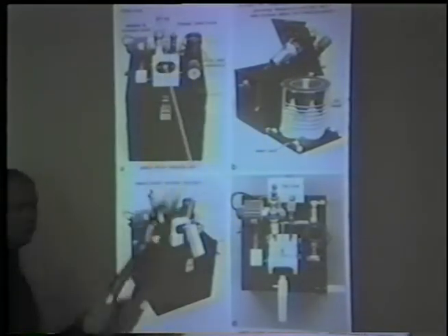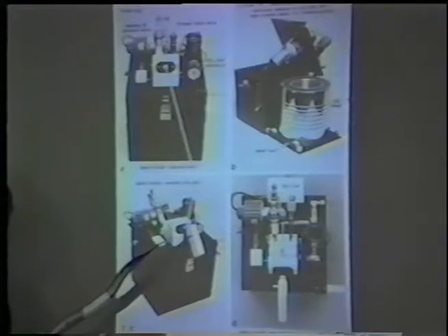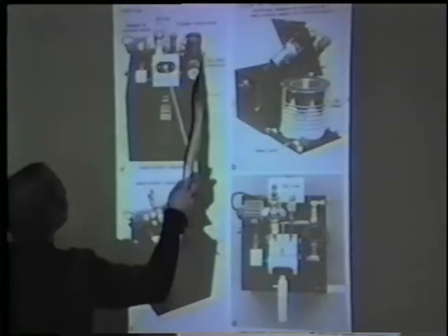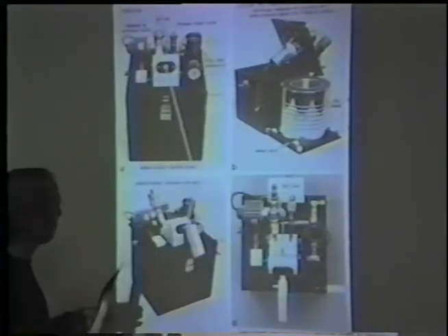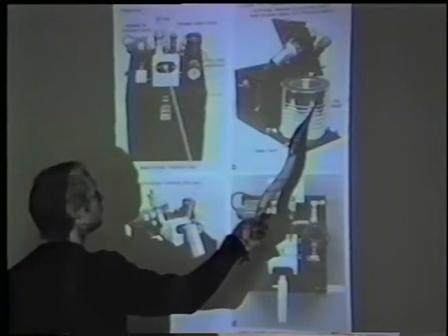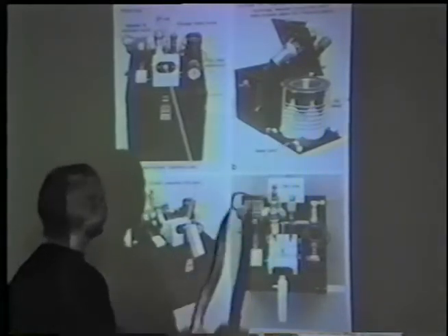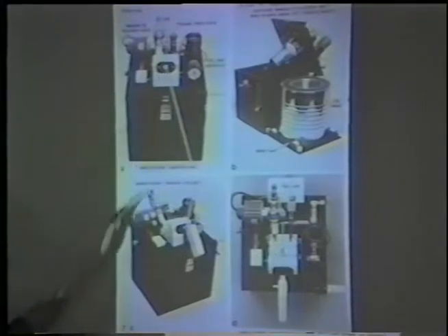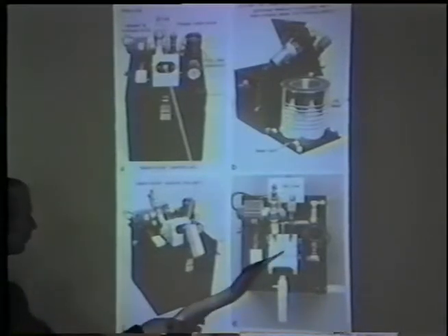Here's the propane inlet valve. It's a check valve, so that when the cylinder is pressurized, nothing can go back out through the propane inlet and the liquid nitrogen level controller. Okay, here's the liquid nitrogen dewar and the little cart that it rolls in and out on. And this is the sample holder insertion port. Here is the sample holder inserted in the port. You see that? Here is the sample holder with the sample positioned between the jet housings.